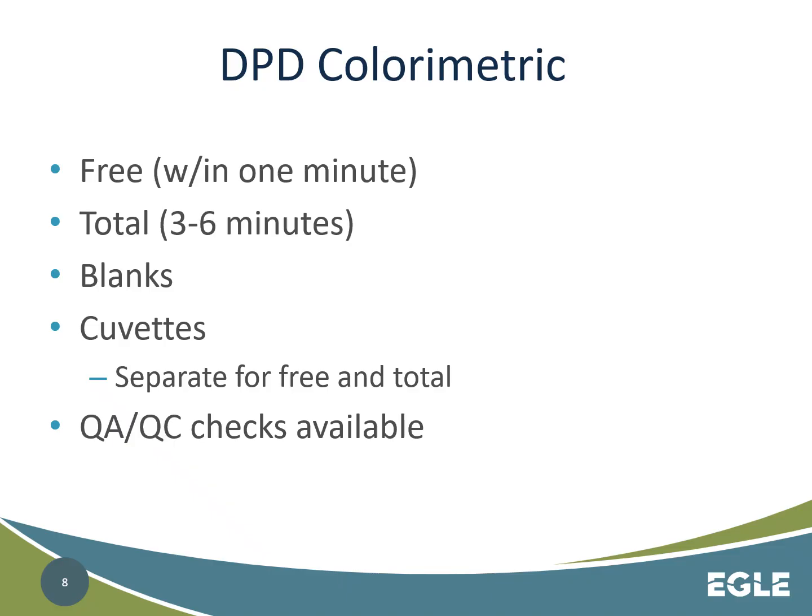So a couple things to keep in mind with doing free chlorine residual: once you add the powder pack, you have to take the reading immediately or within 1 minute. Waiting beyond that 1 minute can cause interferences for the test itself. Now, if you're doing a total, this is going to have its own powder pillow with it. And the total chlorine residual, it takes about 3 to 6 minutes before you're able to read it. And the reason for this is because total chlorine is measuring any mono-, di-, or trichloramines that have formed, or any other chlorine complexes that have formed. So total is in reference to all of the chlorine constituents, not only looking at free chlorine available for disinfection.